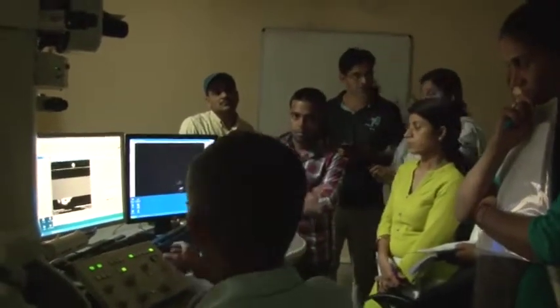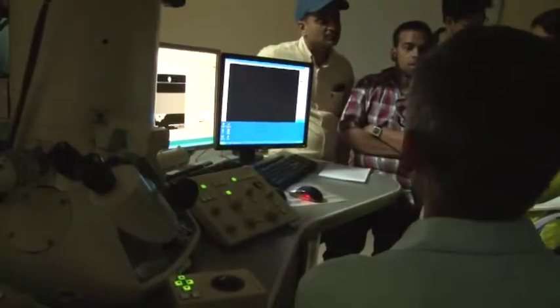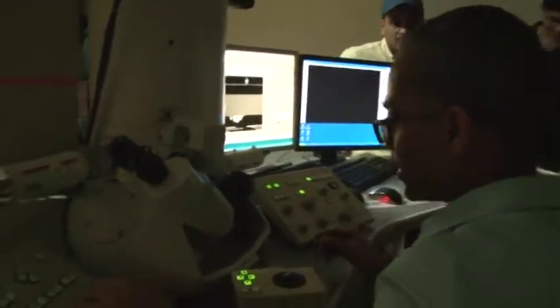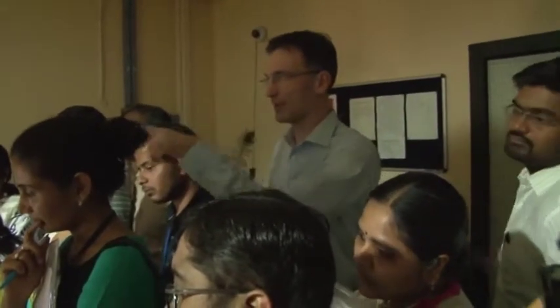All right. So I will then get back. Would you mind changing the camera length so that we see a little more? Is it a square CCD camera, or is this a rectangular image? Can you enlarge that view? Because it was at the corner, the lower edge. I think the diffraction pattern got shifted. This is my feeling. Shifted means I should probably check it.